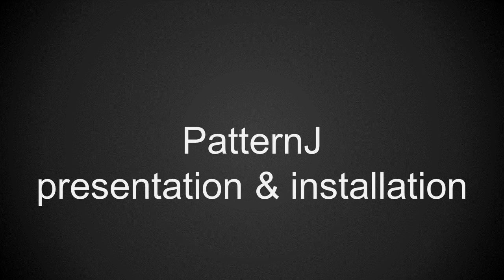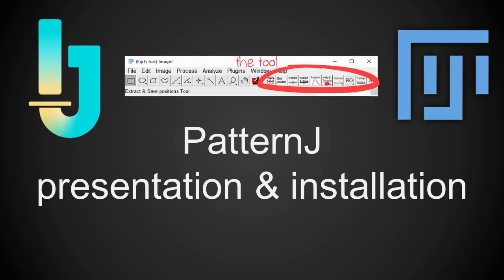In this video, you will learn how to install PatternJ and how to use it with a few short tutorials. PatternJ is a user-friendly toolset for ImageJ and Fiji. It will allow you to automatically analyze regular patterns. Such patterns are a very common type of organization in animals.